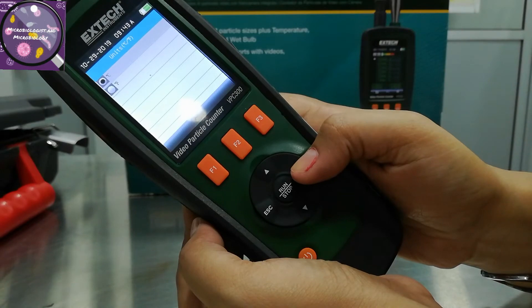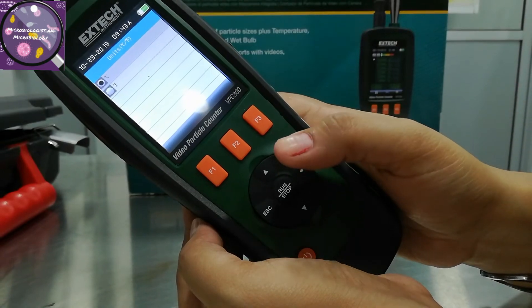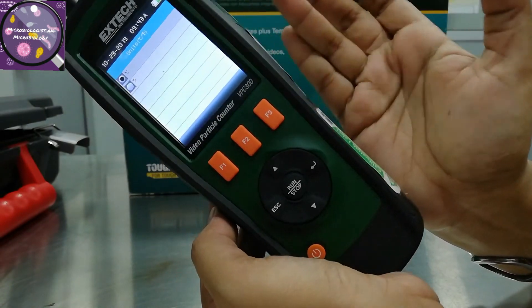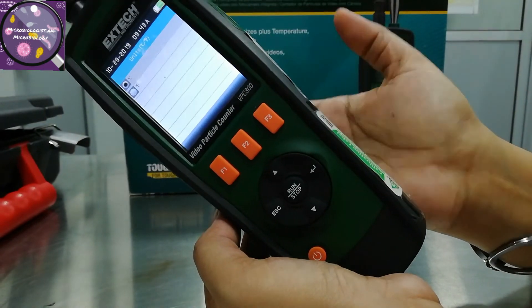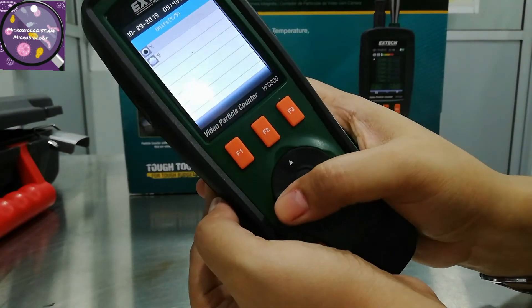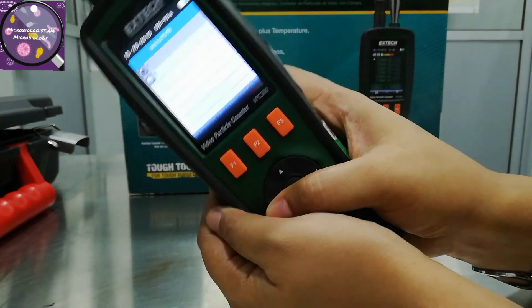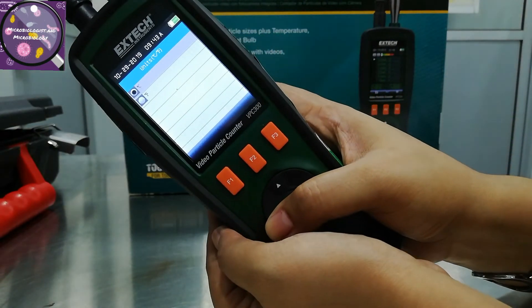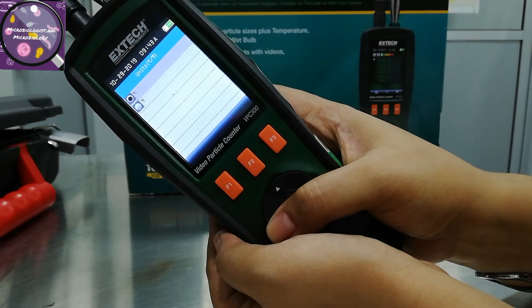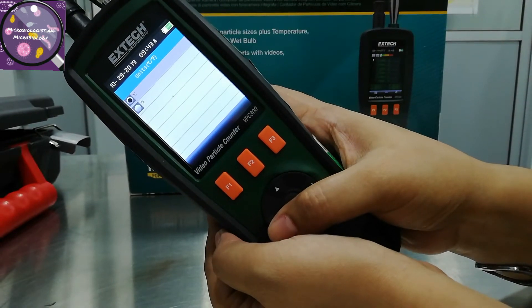There is a unit option for temperature — you can choose Celsius or Fahrenheit. I select it on Celsius.